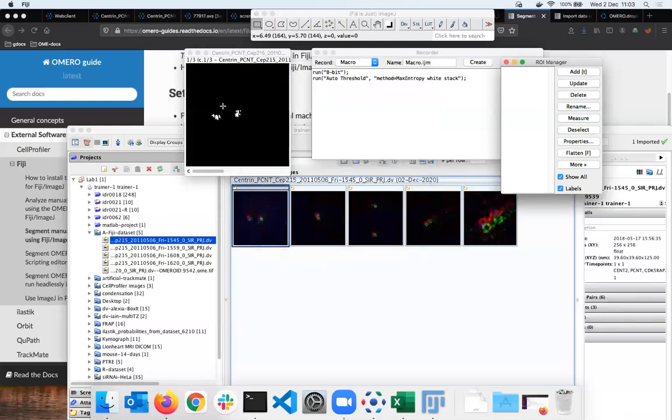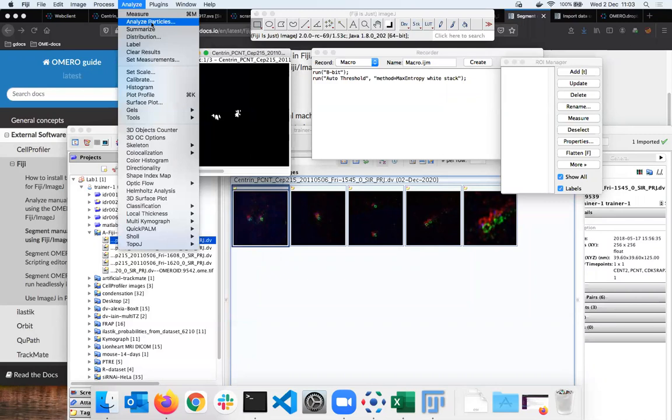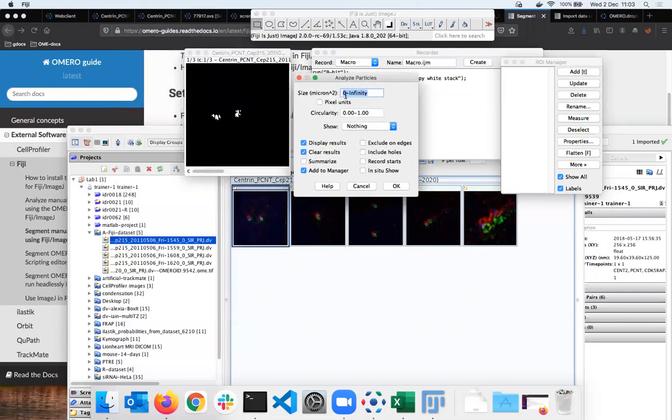And I say, okay, you can see it was successfully thresholded. And with this thresholded image, binarized image, I can now go and use the plugin called Analyze Particles within Fiji, such as this. I know that I have to go with 10 to infinity. I have to go pixel units, and I have to leave these 3 boxes checked.